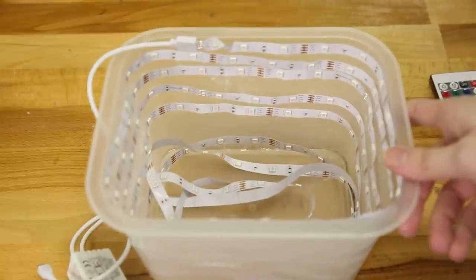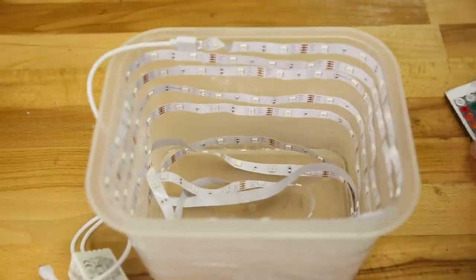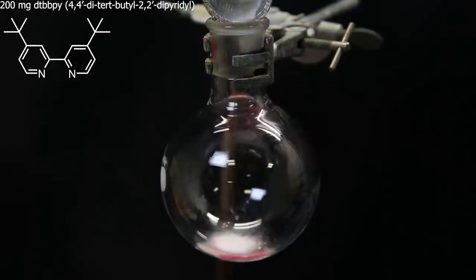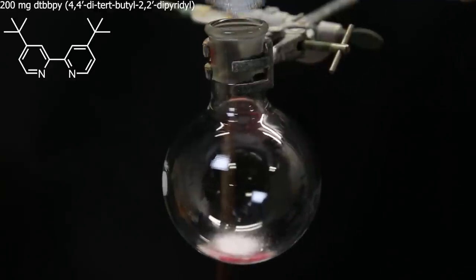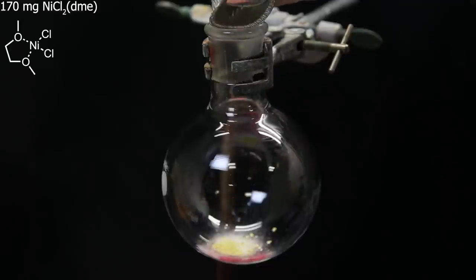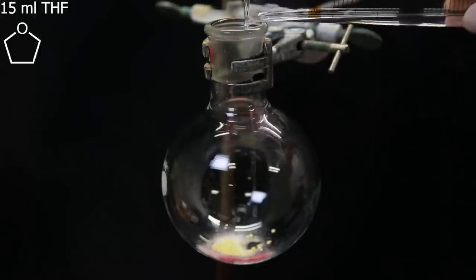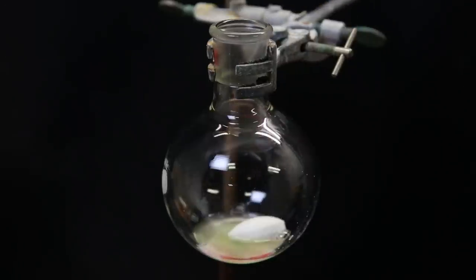It didn't stick very well to the container, so I kinda gave up towards the end, but it should be good enough. Now that all of that is done, I can finally start the photoredox reaction. So I set up a flask and add in 200 mg of 4,4-di-tert-butyl-2,2-dipyridyl as a ligand. I then add 170 mg of the nickel(II) chloride DME complex that I made before. I add 15 ml of THF as a solvent and add in a stir bar.